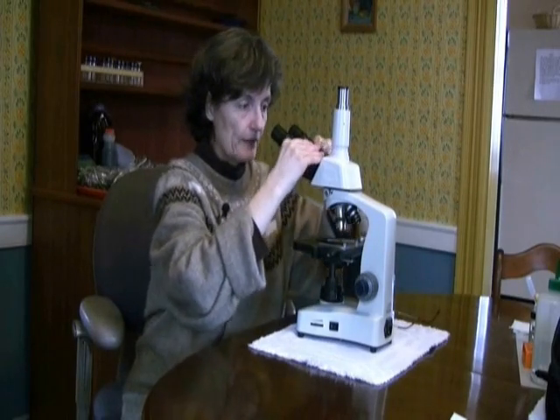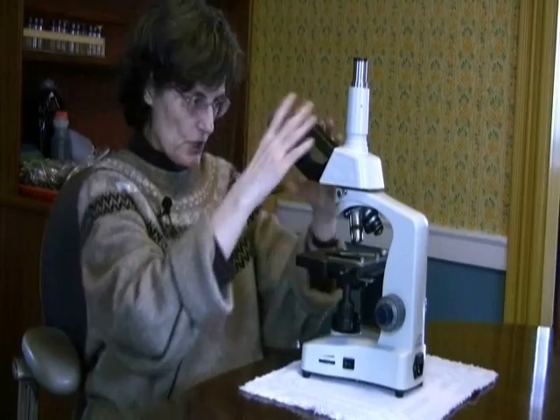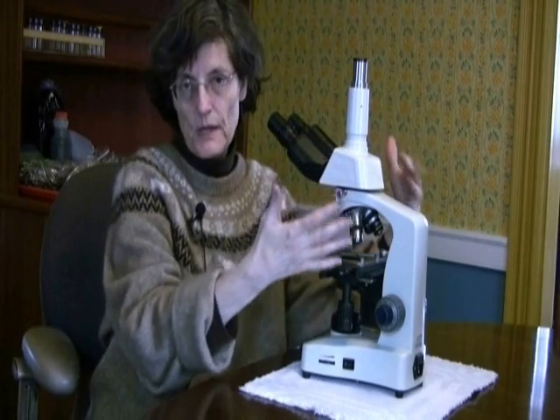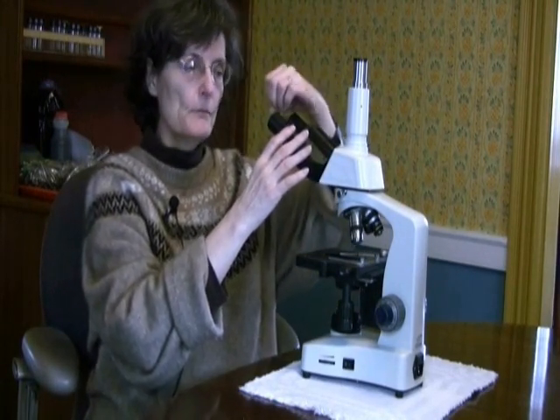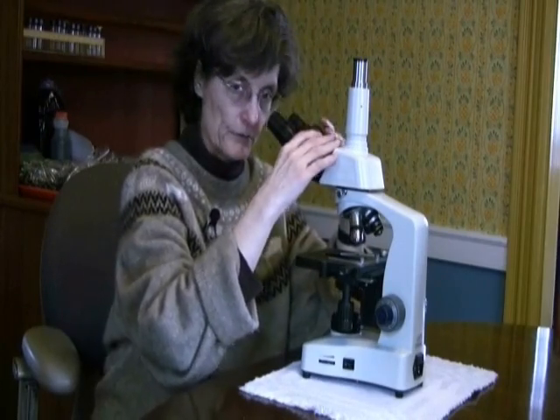Recognize that these are like binoculars. So once we get the lamp turned on, you will be adjusting these to the right place for your eyes. Anytime you sit down at a microscope, you should adjust the eyepieces to be comfortable for your eyes. We do require that you're buying a binocular microscope because you're going to spend some time looking through this microscope and you want to be using both eyes. If you get a monocular microscope so that you've got to close one eye all the time, it causes your eyes to constantly be battling each other. This eye is trying to focus just like this eye, but if it's only got one ocular, monocular, you're going to end up with headaches. So that's why we recommend the binocular microscope.